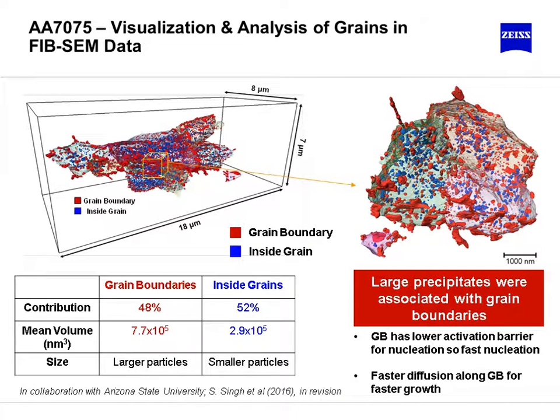So with that, where does that lead? Why do we want that information? I mean, that information from that volume is essential to be able to quantify now that precipitate structure. So it turns out these are magnesium precipitates, and they decorate not only the grain boundaries of the aluminum, but they also are within the grains themselves. And pulling out basic statistics in a spatial context here is essential, and we want this information in the environment of that void that we found.